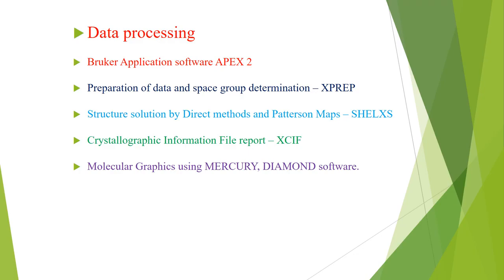This is derived from and compatible with SHELX, the most widely used programs like SHELX 76, SHELX 86, SHELX 93, and SHELX 97, to solve and refine the structure of the single crystal.